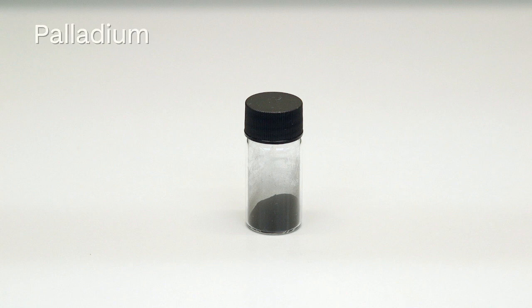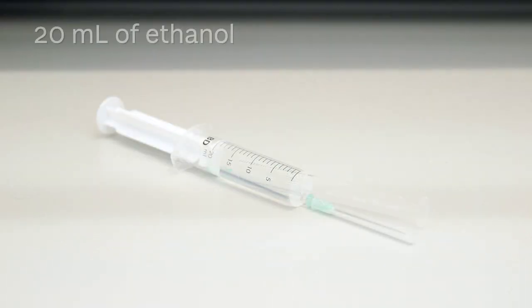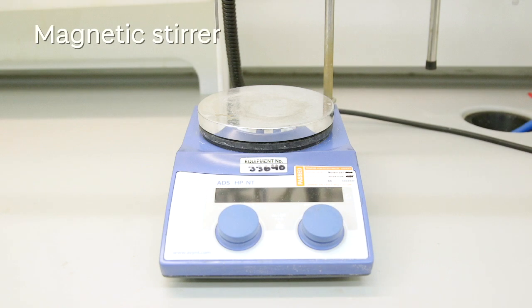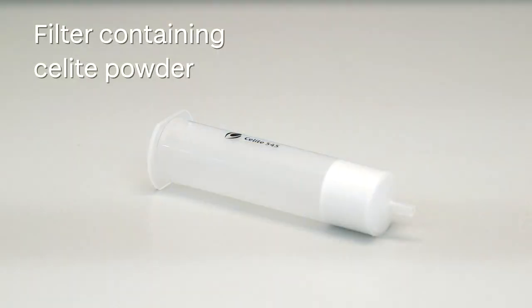You'll also need your palladium, your substrate, 20 ml of ethanol, a magnetic stir bar, a magnetic stirrer, and a filter containing sea light powder.